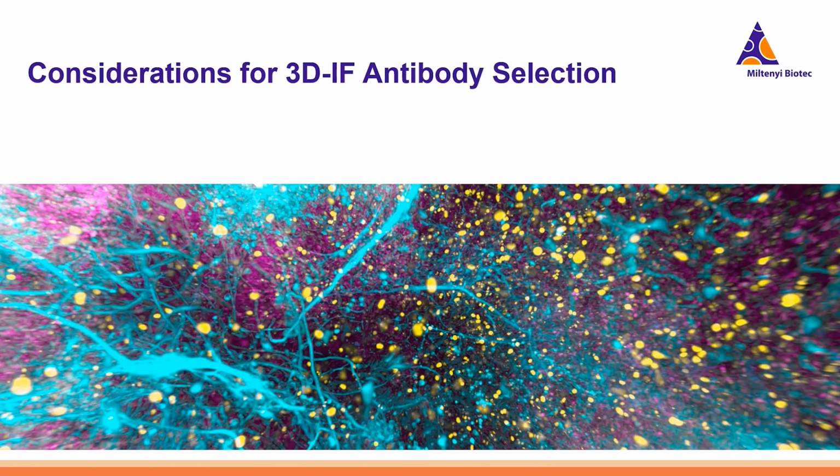Now that you have a general idea about tissue clearing, I want to shift gears a little bit to antibody selection when it comes to 3D immunofluorescence. I think it's important to point out that the time and effort to optimize traditional immunolabeling conditions for 2D imaging on slides can differ quite a bit when applied to large samples in combination with clearing.